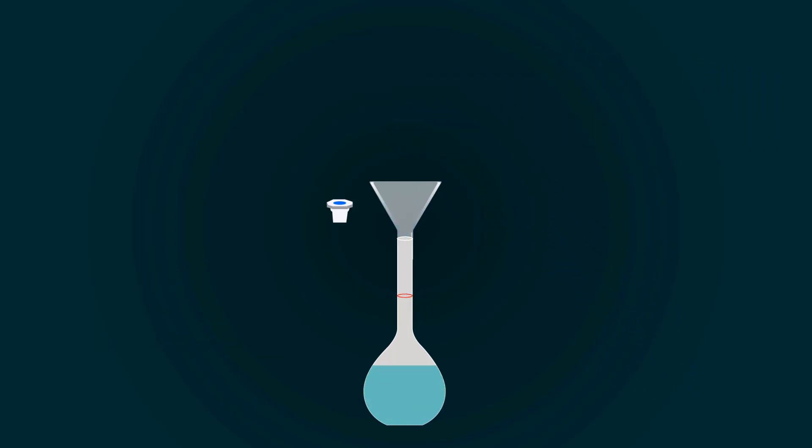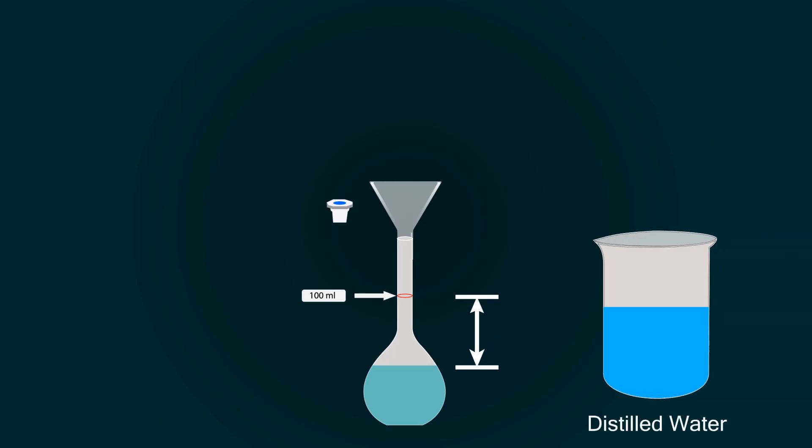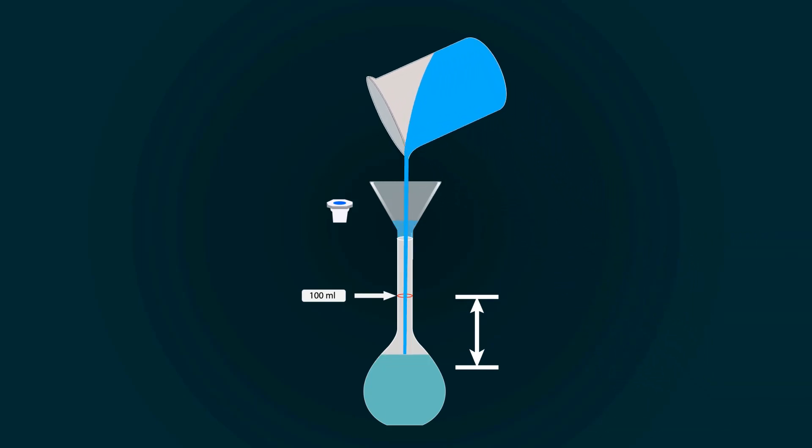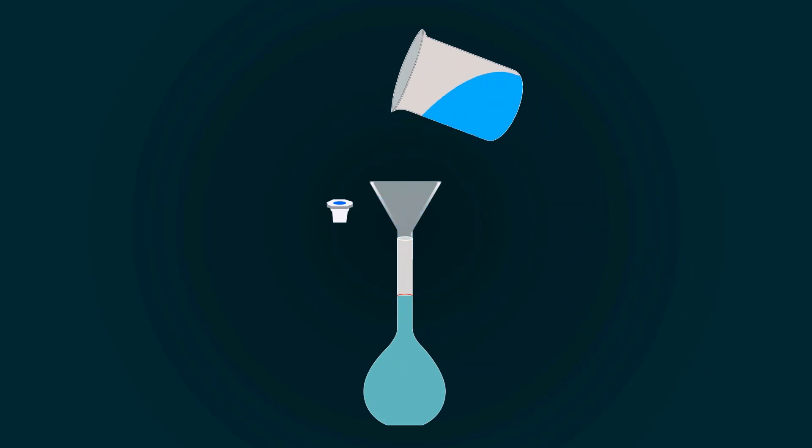You have to fill the volumetric flask up to the 100 milliliters point. For that, you have to add more distilled water. So take more distilled water into an empty beaker and start pouring it into the volumetric flask.